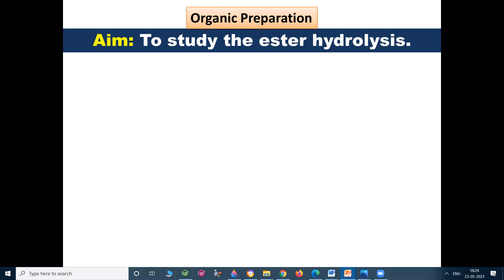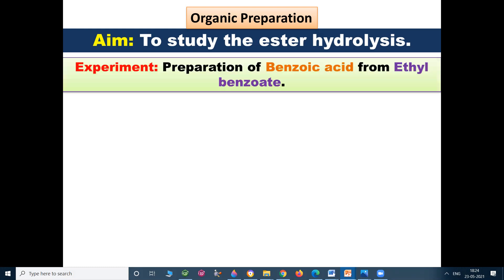Today we are going to see a practical of organic preparation. The aim of the practical is to study ester hydrolysis. The name of the experiment: preparation of benzoic acid from ethyl benzoate.